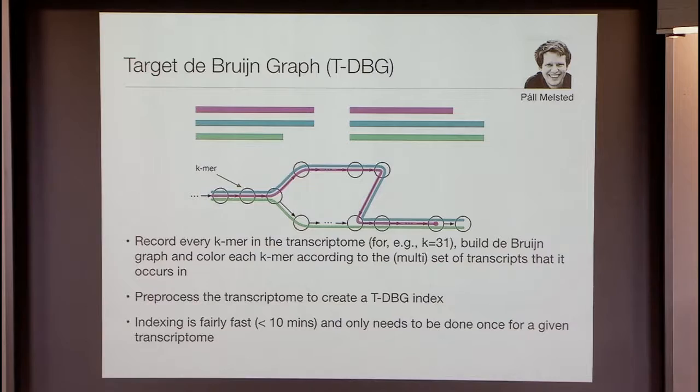We've actually found in practice, for the kinds of read alignments we do, that you'd use something like the 31-mer. That's because reads nowadays start at 50, 75, 150, sometimes 250. In the old days, reads were 30 base pairs, and you would use a smaller k, but we use k equals 31. We also choose k to be odd because, when you build these graphs, and I've glossed over this detail today, sequences in DNA come in the forward and the reverse complement. And you identify the k-mers and their reverse complements in this data structure. It's more convenient that way. When you do that, you can do even k, but it gets complicated. It's a good exercise to figure out why it's complicated, so I'm not going to tell you. You can think about what it is about reverse complements and odd sequences that go well together.